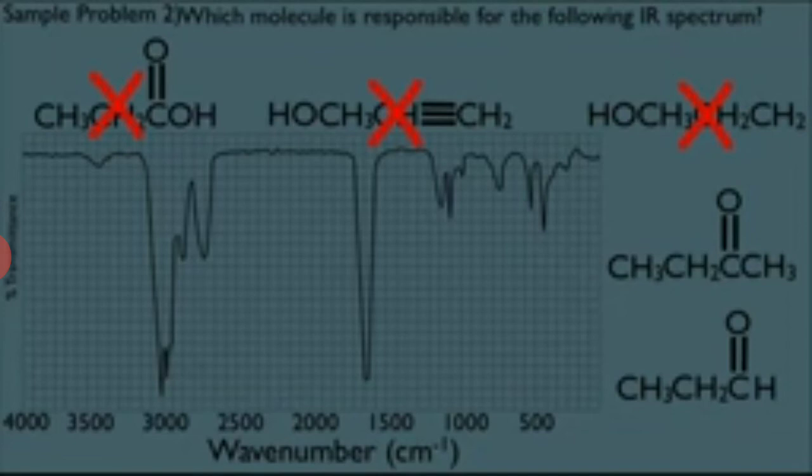If you refer to different textbooks of IR and IR ranges, you will observe one key note, and you can make a note of it, which makes aldehydes different from other compounds containing carbonyl groups. You can easily differentiate aldehydes from ketone, ester, acid, etc.